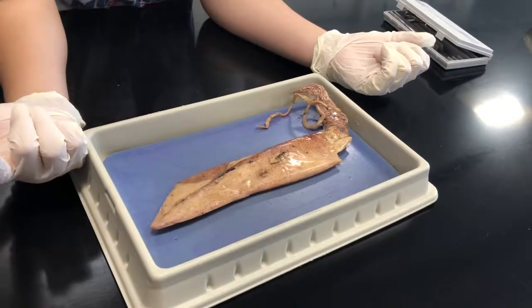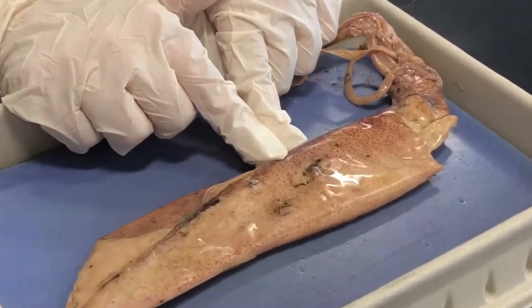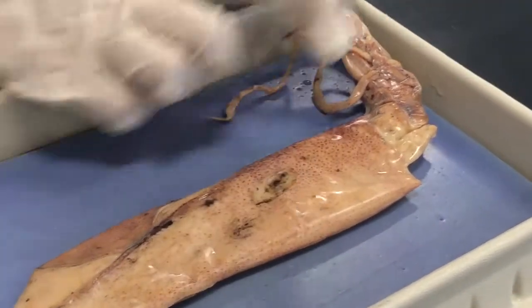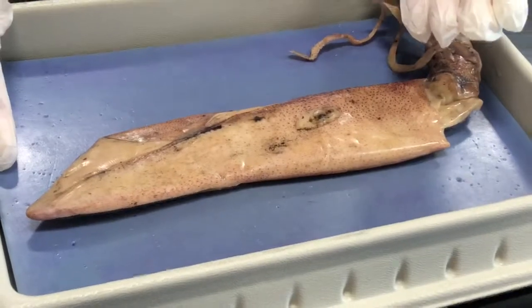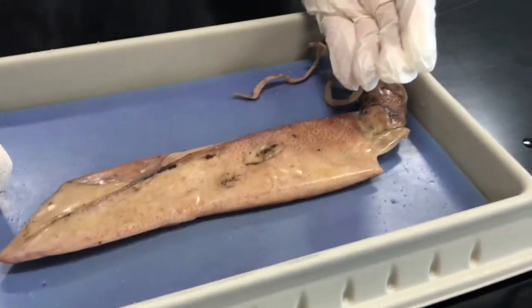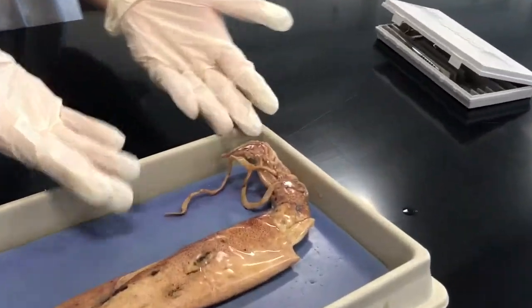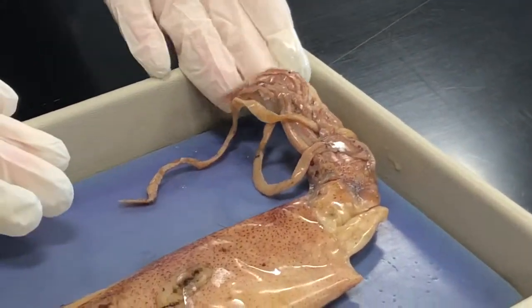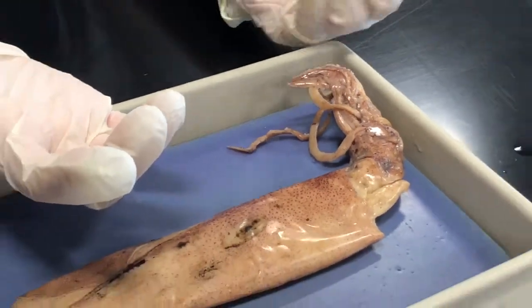The first thing is the chromatophores, which are a way to hide from predators. It allows them to blend in and camouflage with their surroundings. Then there's the mantle, through which water enters the body and is used for movement and helps in heart functions. Then there's the suckers on the arms, which catch prey and restrain it to bring it closer to the mouth.